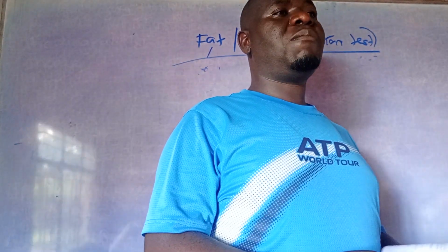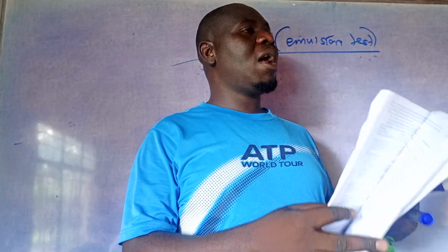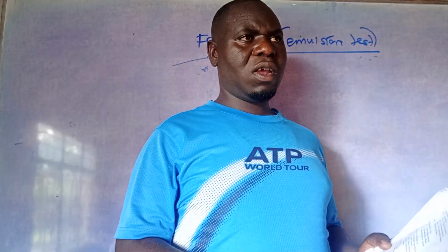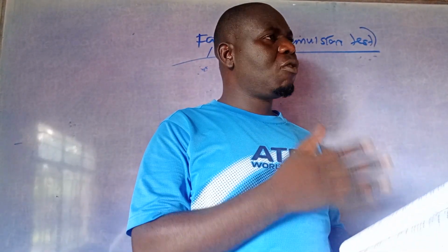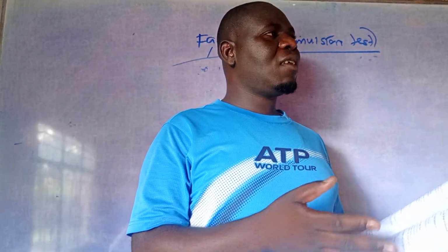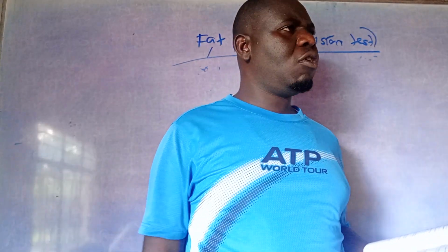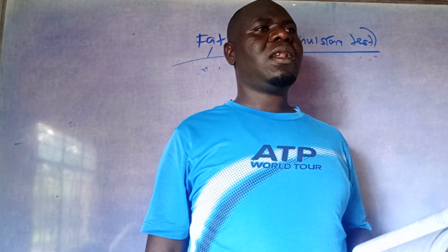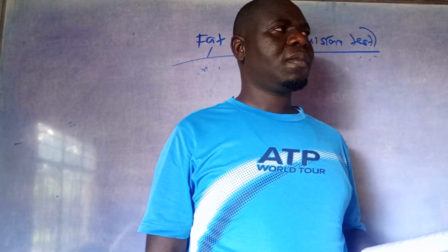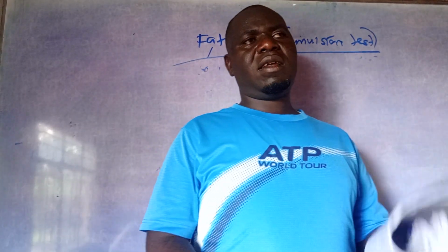So what's important is knowing the procedures and also what happens. Because even in paper 1 and paper 2, these things come up in the exam all together. Last time you saw the questions on paper 1, right? Yeah. On paper 1, for example, what will happen if the starch is present, or if it's absent? You need to know these things. Even in paper 2, theory, they can ask you a question. Like last year, the question about onion. So I'm testing for onion. You need to know all the procedures. If there's a question, you can ask.